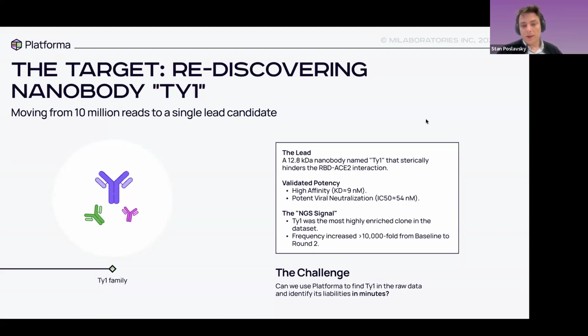In the study, the NGS dataset was used as a support for the discovery, while we are going to slightly change it and use NGS data as a driver for our discovery that we will further validate with the functional assay data. So with this setup, I will switch to the software, to the live demonstration.